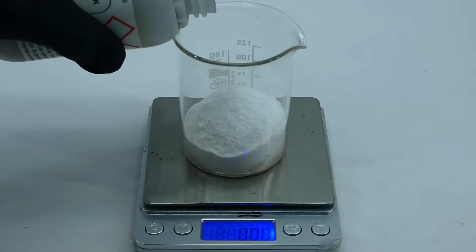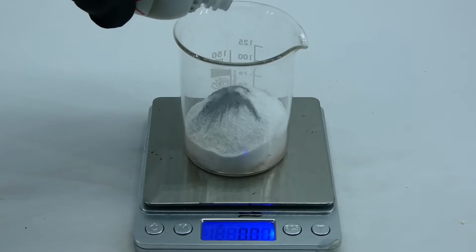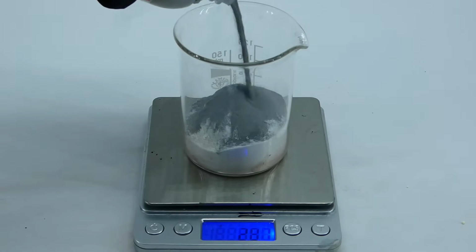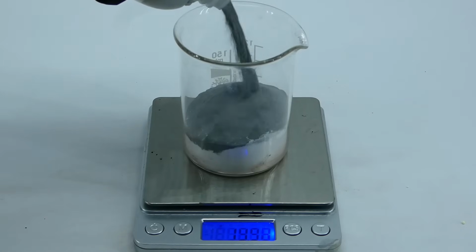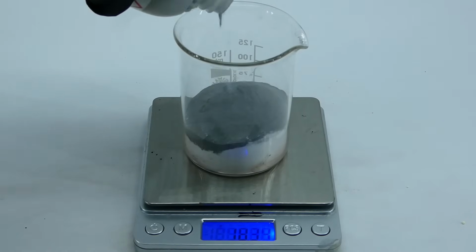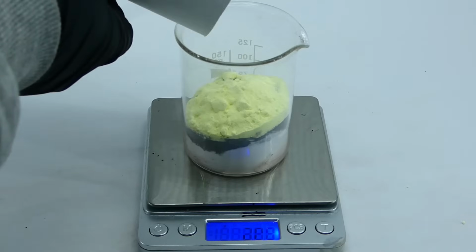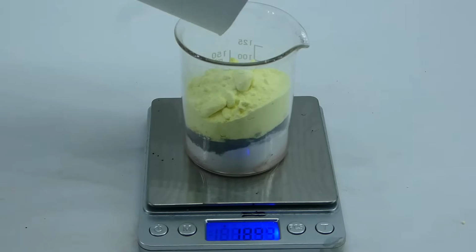I then proceeded to add 20 grams of aluminum powder as my metal. Different metals such as magnesium can also be used, and the general rule for making thermite work is that the metal used to reduce the oxide must be more reactive than the reduced one. Anyway, I then proceeded to add 24 grams of sulfur into the mix, and I promise that I will explain what it does in just a second.